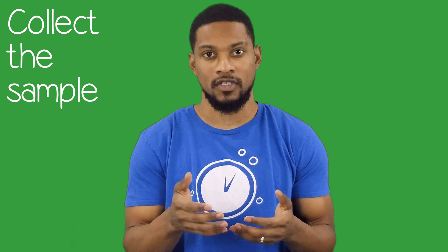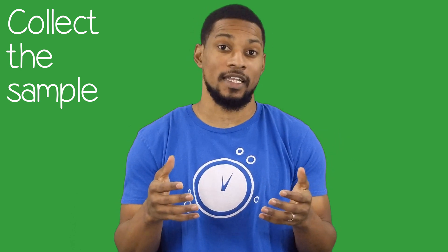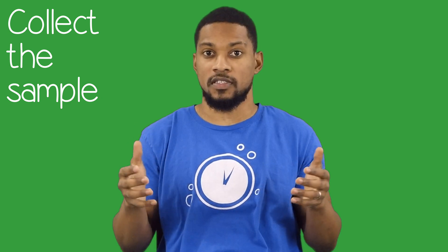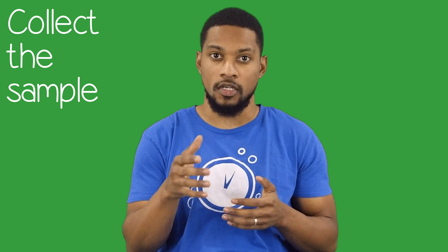First, you need to collect the sample. Because this video is to demonstrate how to test with H2Blue, my source water is irrelevant — I really just need hydrogen-rich water. But if you're testing a hydrogen water device, you need to take your sample straight from the system. Don't fill up a glass and then pour your sample from a glass. Hydrogen gas starts to escape from your sample as soon as you pour it. Every time you move the water or pour it into something, you are losing hydrogen and it will affect your reading. With many systems, especially flow-through units, you will need to run a little water to clear the lines to ensure you're testing fresh H2 water.